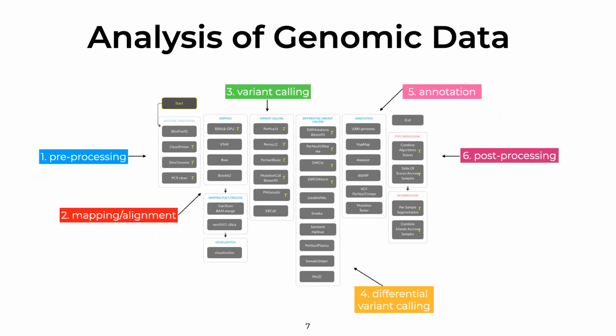So in some cases, we do a variant calling pipeline. That variant calling pipeline is explained in Genomics 1. The objective of a variant calling pipeline is to identify variants, in that case, specifically associated with somatic mutations. Somatic mutations are not the inherited kind, not the ones that you inherit from your parents. Those are called germline mutations, but those are variants that start appearing over time, eventually leading to some disease.